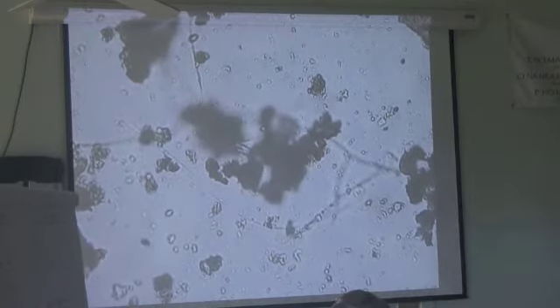So, close one eye, don't care which one, and set the other eyepiece at whatever it happens to be. If it doesn't move, then there you are. And now focus with your fine focus on something up here. Whatever you choose it to be, focus on it. And now we're going to close that eye and go to the other one. We'll use the focusing mechanism on the eyepiece to bring this eye into exactly the same plane of focus. So this eye gets that thing focused exactly the same as what you had in the other eye. And then that will prevent those headaches from happening.